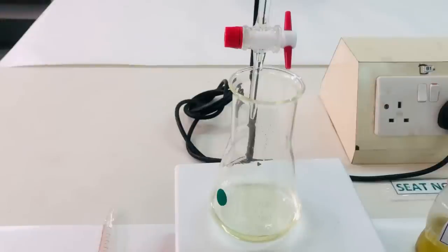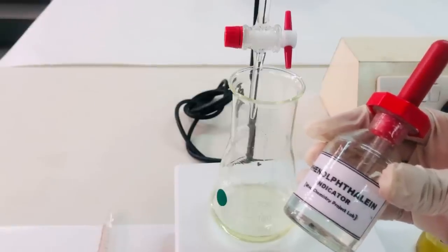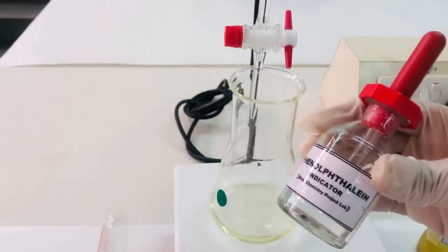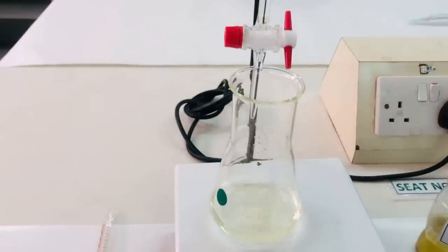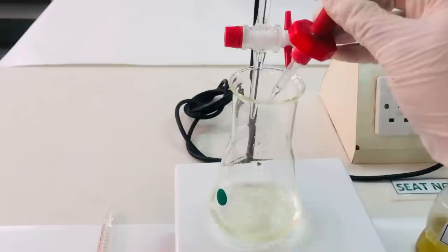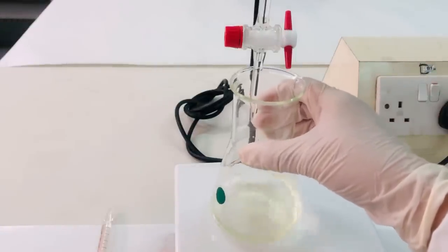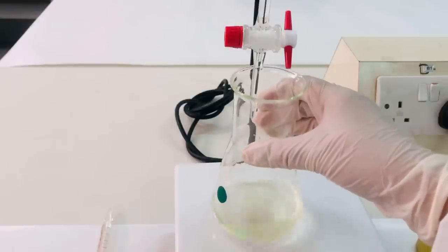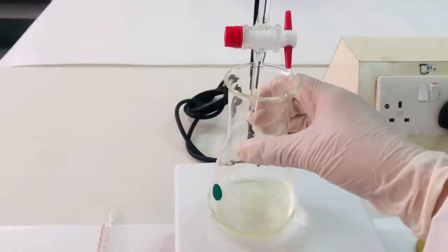Coconut oil and neutralized solvent mixture is placed on the hot plate, and now we are going to add the indicator phenolphthalein to this sample. Around 1 to 2 ml of phenolphthalein indicator will be added. Shake the solution so that all the things mix together, and start your titration with the standardized alkali solution.